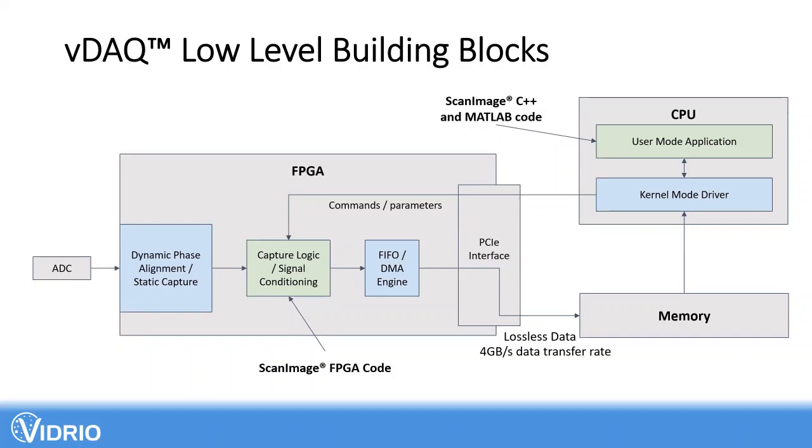Cool. And in terms of the other questions that you said, I don't see a scenario where it would be necessary to pass things directly to the GPU. Am I correct in that? I seem to remember last time that we chatted, not with you, maybe with somebody else, that you were also looking into voltage imaging, right? To add acquisition. I don't know if it's going to go through the same type of acquisition board or some other type of acquisition. That's definitely a use case that you might want to transfer to the GPU. Okay, that's great feedback. Thank you. No problem. Thanks.